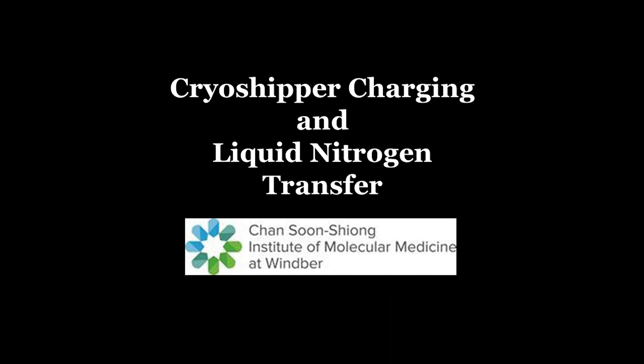The Biobank staff at Chan Soon-Shiong Institute of Molecular Medicine presents cryoshipper recharging and liquid nitrogen transfer. Specimens that require transportation to or from the institute must be packaged in a way that the cold chain is maintained during transit. Cryoshippers are becoming more commonly utilized so that cryogenic temperatures can be maintained during transit and protect samples when delays occur. This video contains instructions for charging cryoshippers.